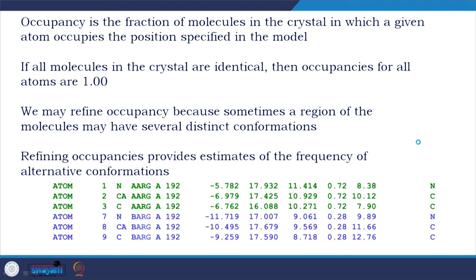What is PDB? PDB is the Protein Data Bank, where all the biological macromolecules whose 3D structures are solved are deposited.